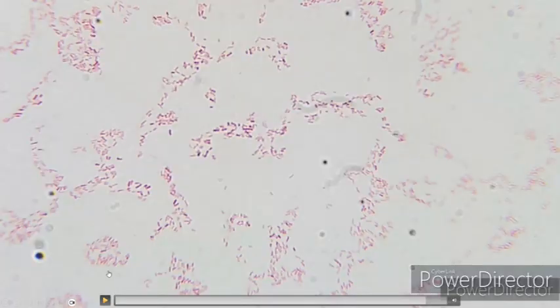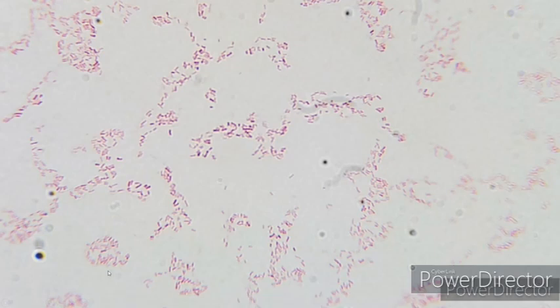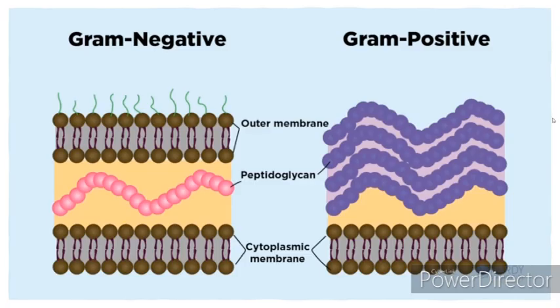So here it is on the 100x, and also zoomed in since my picture is a little blurry, and I apologize for that. But we can see almost a reddish pink, like I was explaining safranin is notorious to be. So in my opinion, this was a very good gram stain of E. coli. Gram negative is gram negative for a reason.